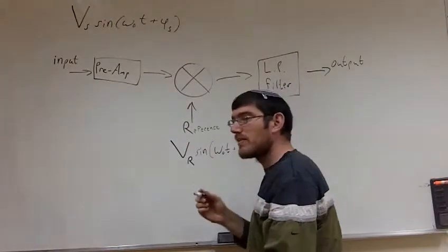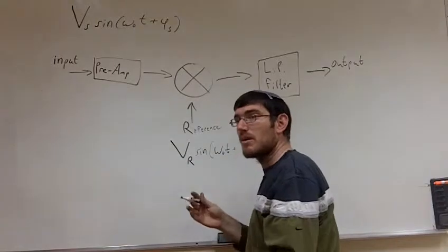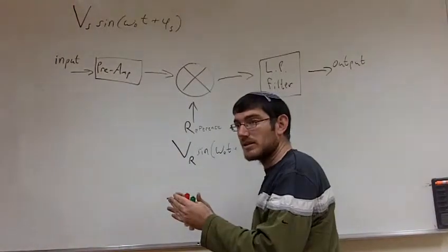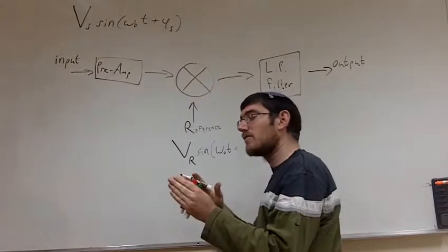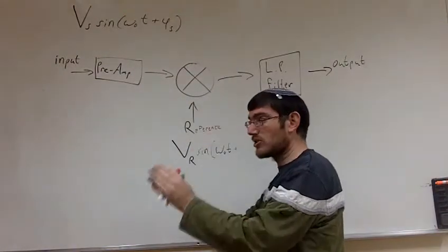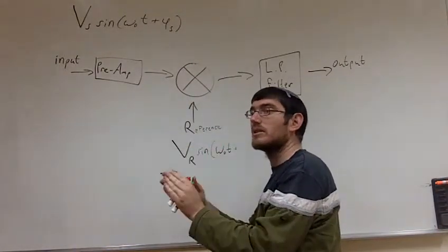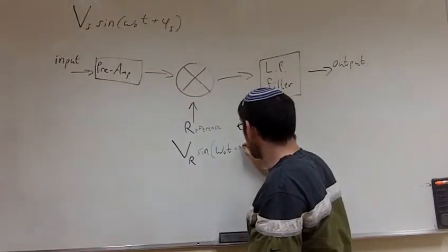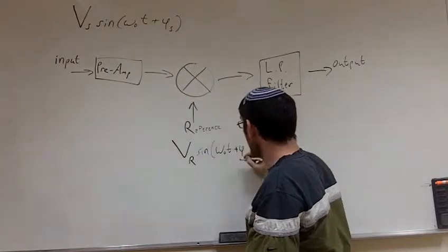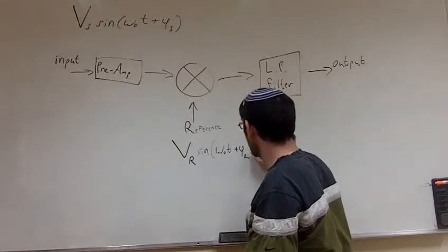Maybe you heard of PLL, where we do look at different frequencies, how the frequency is shifting. In our case, we're not looking at how the frequency is shifting. We're concentrating only on the resonance frequency. And this is the most important thing: the reference also has a certain phase.